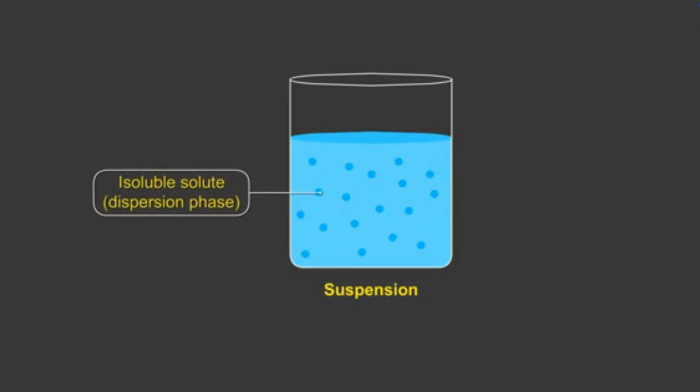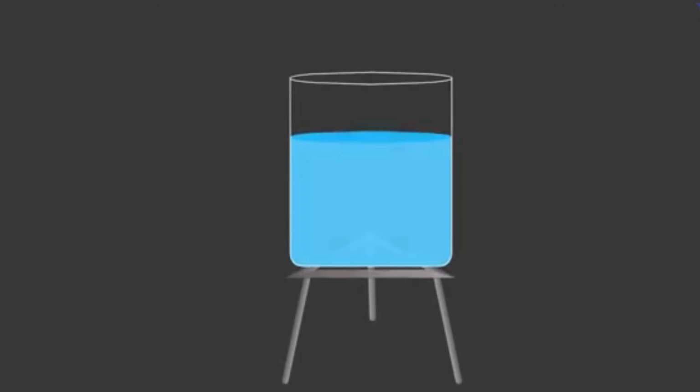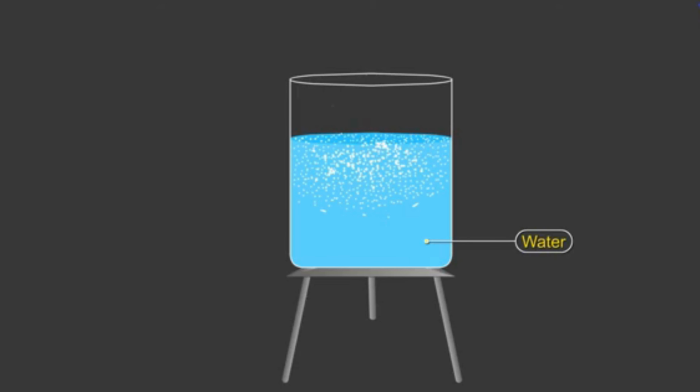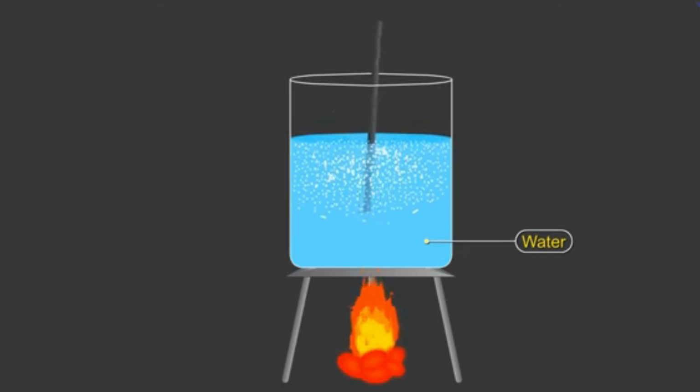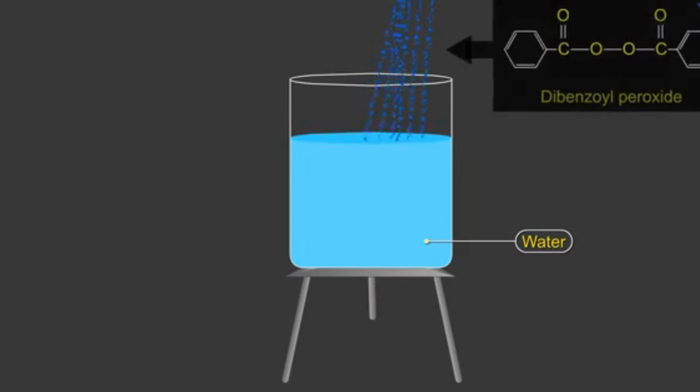For a classical PS-DVB resin, styrene and DVB are dispersed in an aqueous phase containing suitable suspension stabilizers. An organic monomer mixture in an aqueous solution forms tiny, spherical droplets. These organic droplets become the precursors to the final resin particles. An oil-soluble radical initiator polymerizes the vinyl groups inside the dispersed organic droplets. Styrene plus DVB yields cross-linked PS-DVB beads.